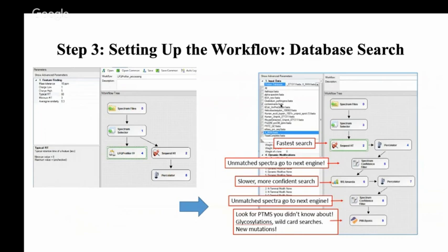These are very bulky proteins that often fly very prominently in the mass spec and mask your important biomarkers. So selecting a contaminant database is very important while you are analyzing your file, because this will remove any false positives that you might detect in the downstream process.